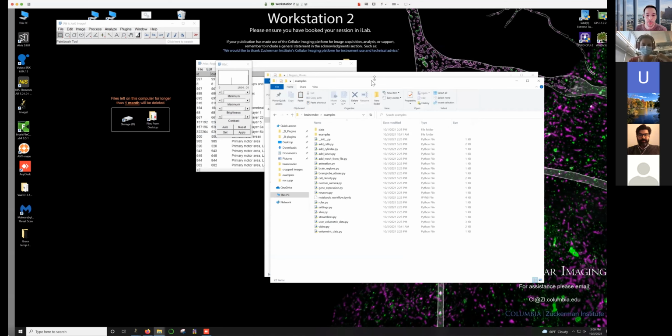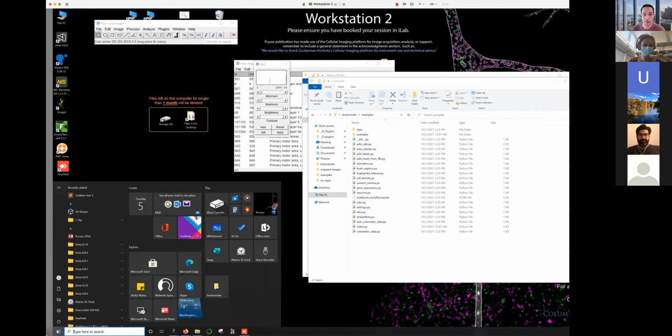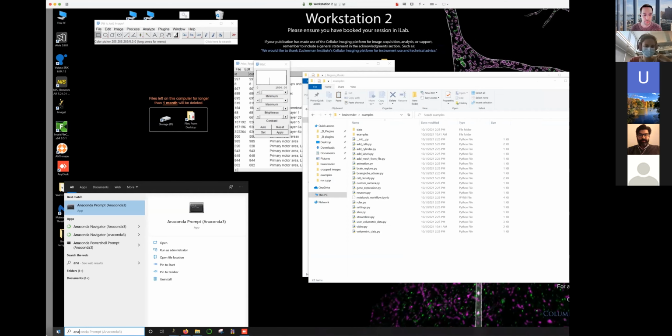Okay, so we've downloaded BrainRender. The next thing we need to do is set up the environment. So if you're working on a PC, after you install Anaconda, you should have an Anaconda prompt. You can just search for Anaconda prompt in the Windows button.